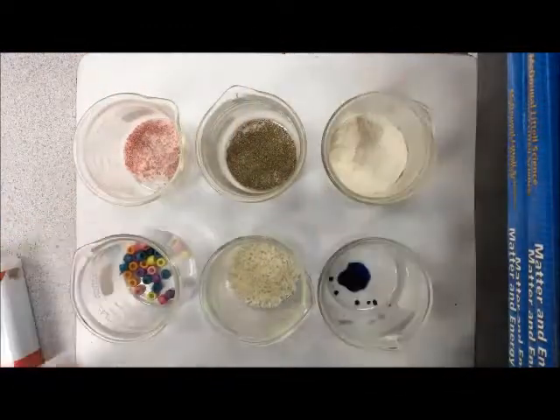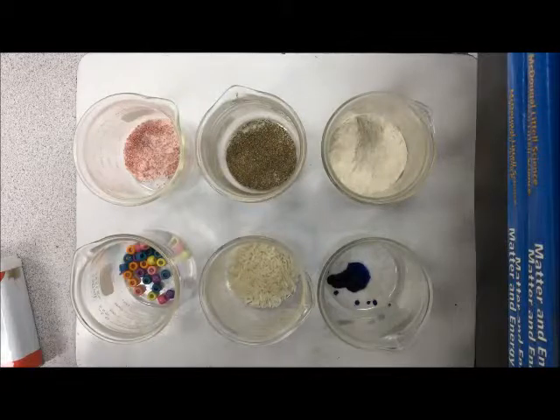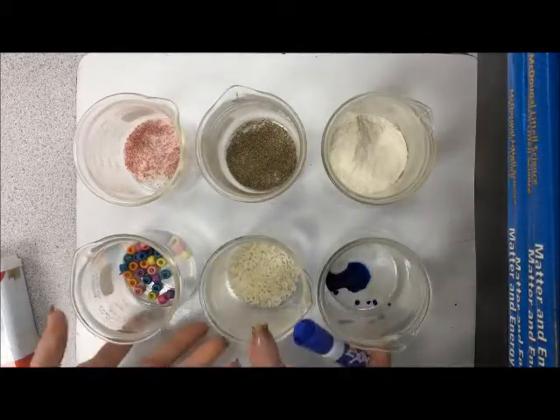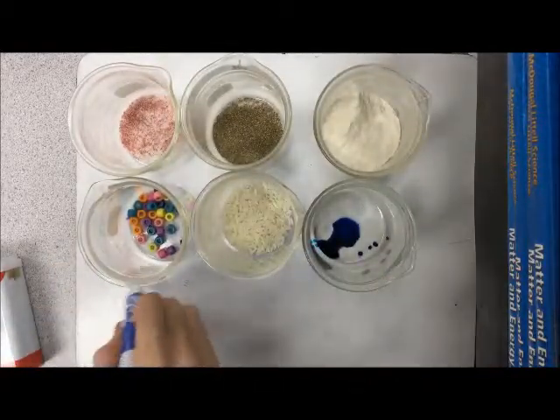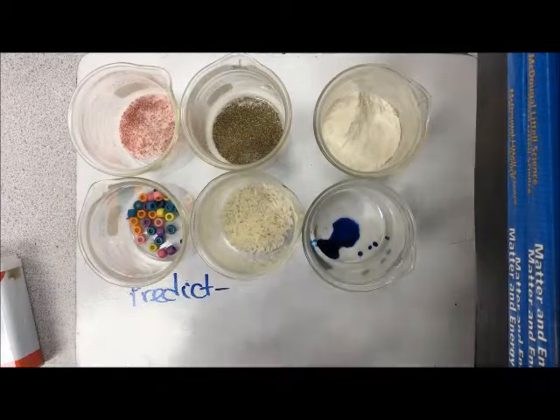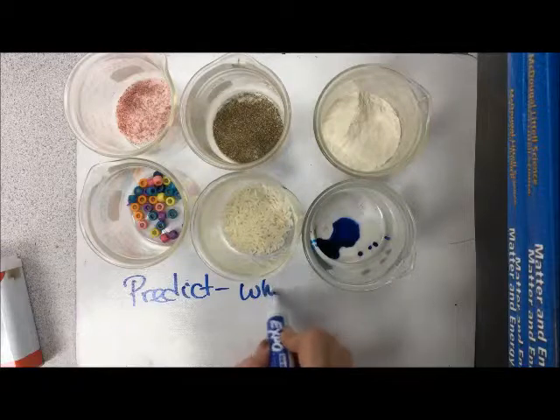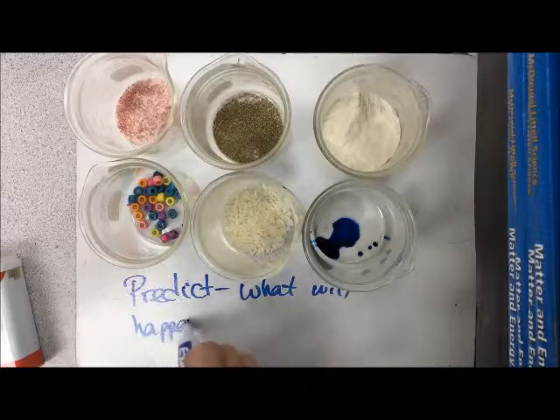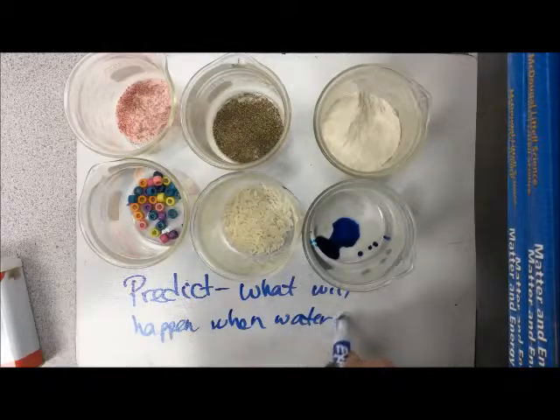Chemicals, if you will, because they're all made out of atoms, and we know they're made out of atoms because they all have mass and they all take up space. So I want you to predict. Predict means pre-dictate. So pre-say what's going to happen before you really know what's going to happen. What will happen when we add water to each of these?